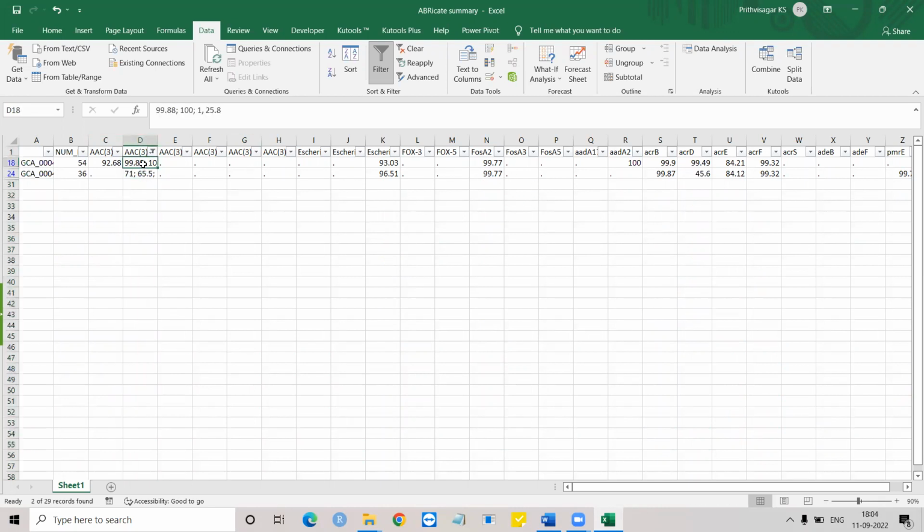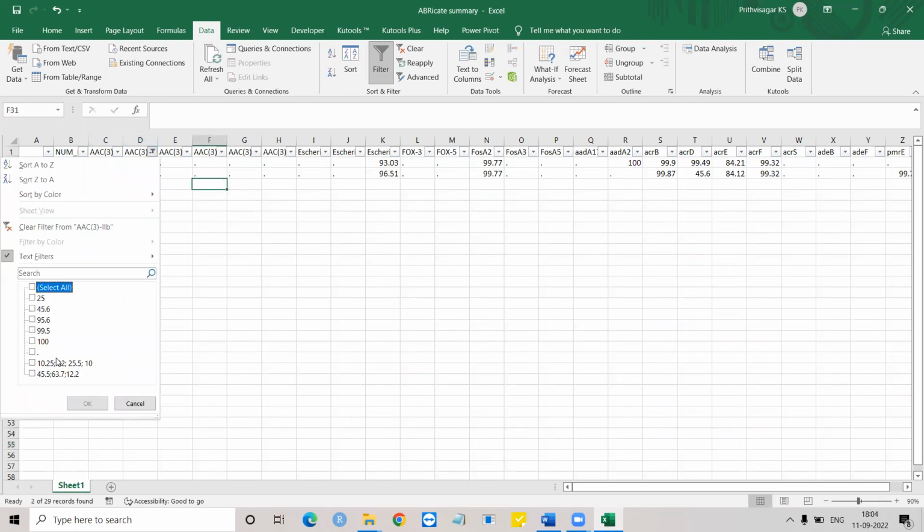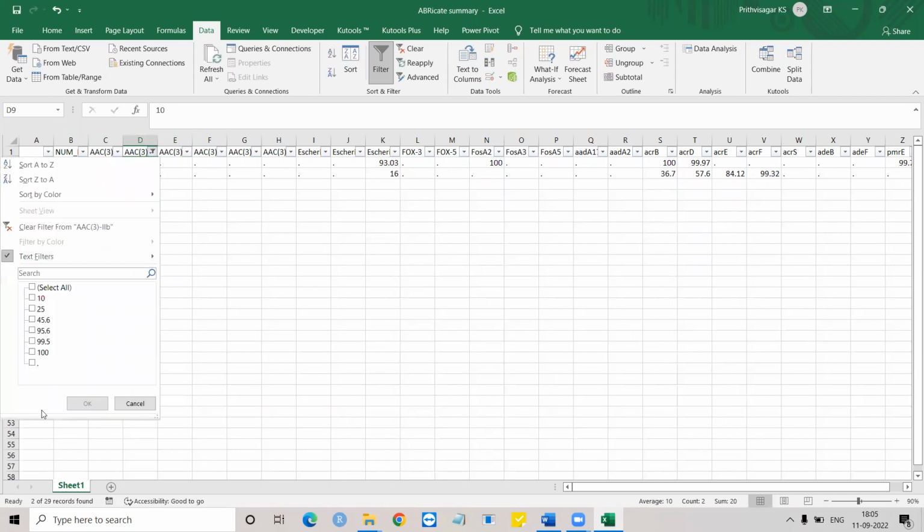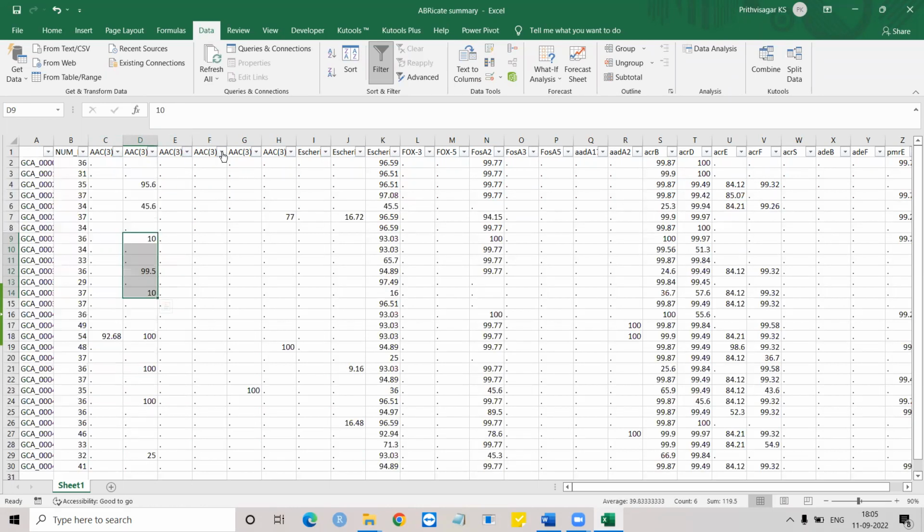For the selected cells, replace the values with any single value that is above 75. Then in the next step, select the multiple-value cells where all the values are less than 75. Click those two cells, in the same column that I was editing, and replace the values with any single value that is less than 75. Now all the data has been converted to single values. Go on checking each column, and if you find multiple values, edit them. That is the first part.